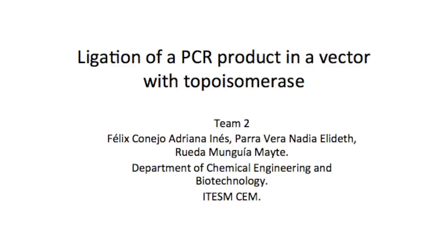This is because it binds double-stranded DNA, especially at the sequence CCCTT, leaving a free end. But with the interaction of the adenine of the PCR product, the bond is destabilized and forms a new ligation.